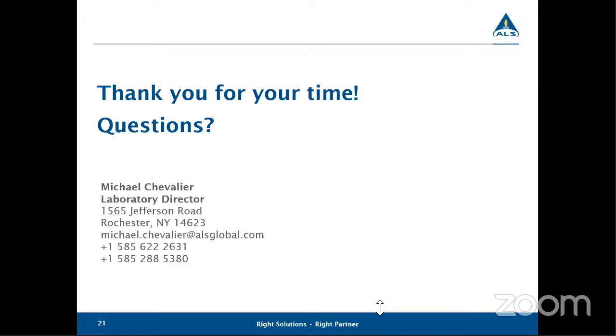All right. Kelly would like to know, are there larger bags for 4-inch wells? Are there different lengths available? So there aren't any larger bags for 4-inch wells. What we have had clients do in the past is hang multiple PDBs. It gives you a lot of extra room. So you could hang 2, maybe even 3 passive diffusion bags from one point on the line in a 4-inch well, so that they're all in that same screen interval. And as far as the length, yes, we make them up to 48 inches long for both 1.25-inch diameter as well as 3/4-inch diameter.